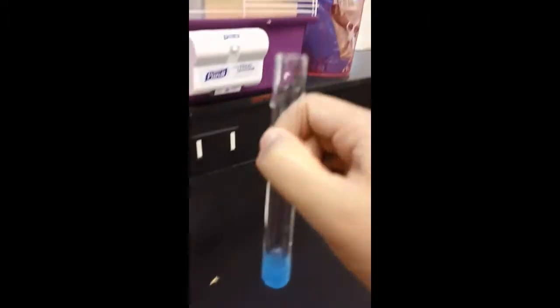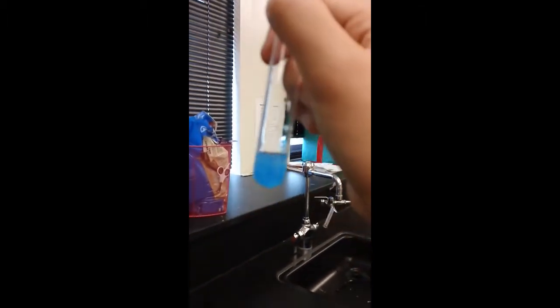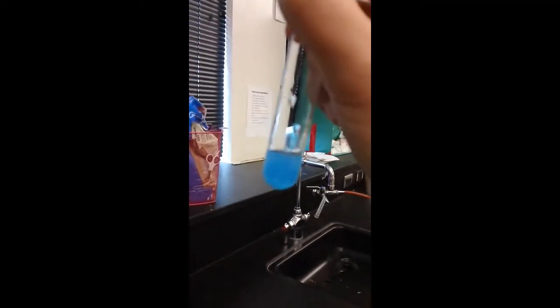I know it's kind of hard to tell in the video on this one, but if you look in here, there's some solid going on in there. Okay, next one we have is now our copper, our Cu. And this one again, I can tell, and I'm not sure if the video is very clear on this, but there is some solid in this one, and it's almost like a jelly blue solid. And lastly, we have our K.